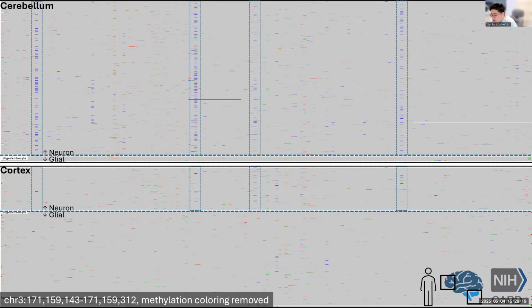So the blue dots here are still mismatches in reads which can be consolidated into SNVs. Here we can see that the mismatches only exist in our classified reads from neuron cells, which means the same cell type in 2 tissues in the same individual contains the same somatic variants. I think the most important thing is, with the current allele frequency-based somatic variant detection method from bulk sequencing data, we are almost certain the somatic SNV we saw in the top panel tissue would be identified as a germline variant, which is in fact a somatic mutation.